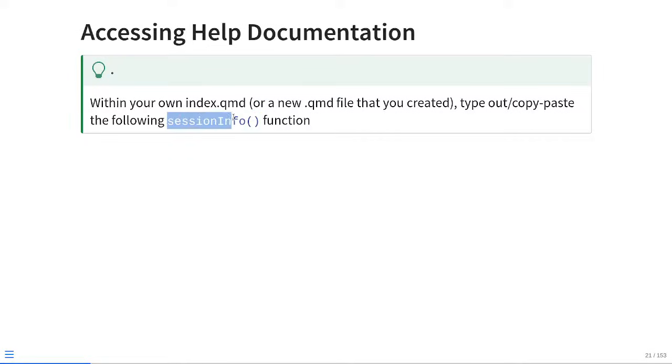So you'll have the name of the function first, then followed by the little parentheses, and this together basically says, hey, run this particular tool, and within the parentheses, you provide any arguments that you need to have executed. So in this case, we'll look at the session info function, which is how we see what packages have been attached to the local environment since we last opened our Positron browser.